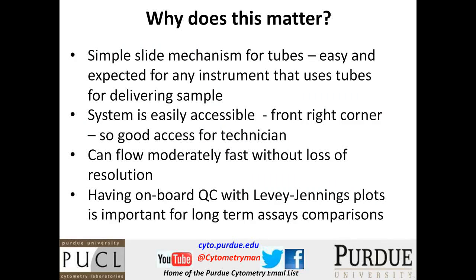So again, why do all these things that I've just discussed matter? Why do I care? Well, I like the mechanism for being able to switch from tube to plate without doing anything but pressing a button. I think that's actually quite nice. And also it's very easily accessible. It's open, so putting a tube in there is easy, and the technicians in the lab like that very much.